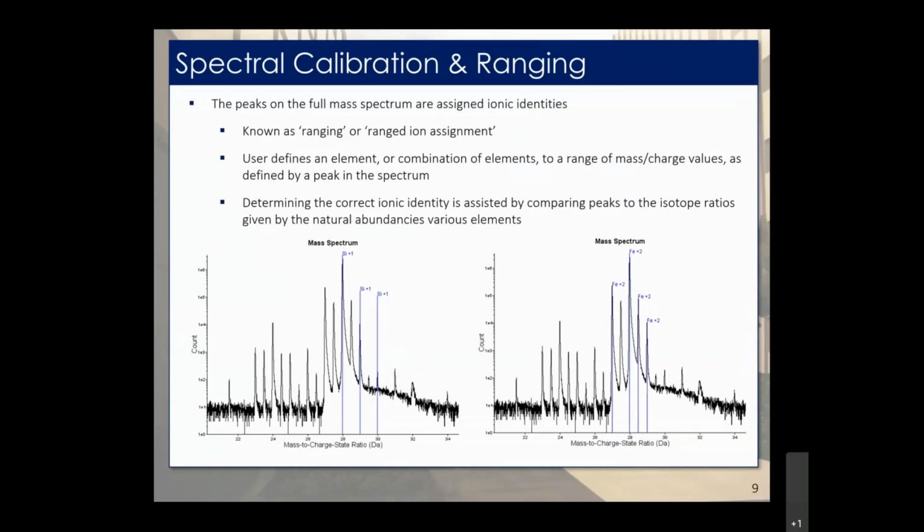And to help us identify that, we take advantage of the fact that in atom probe, since it is a mass to charge ratio spectrum and we can see the different masses of the different elements, this gives us the ability to resolve different isotopes.